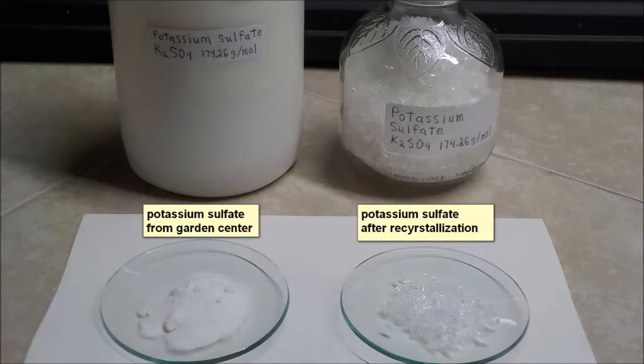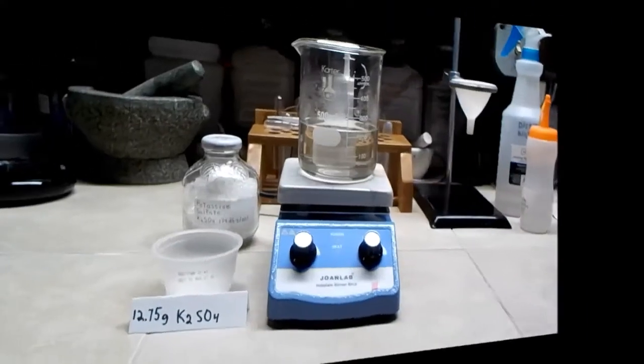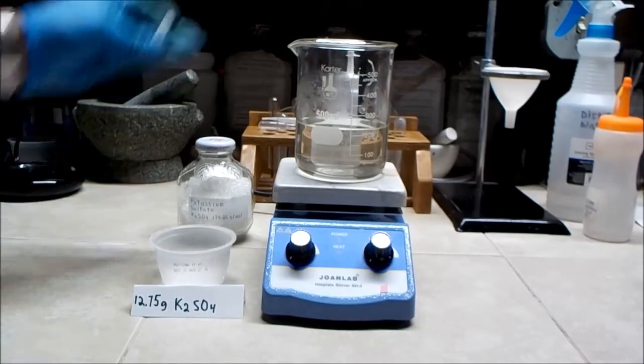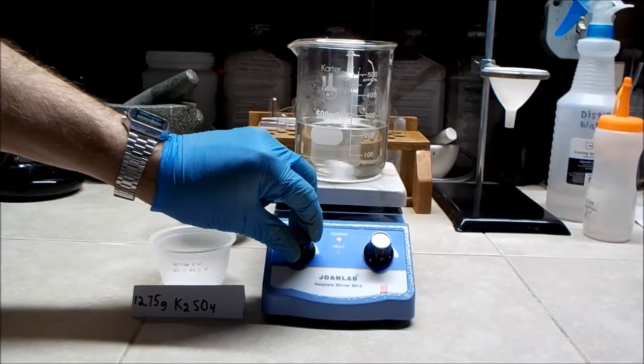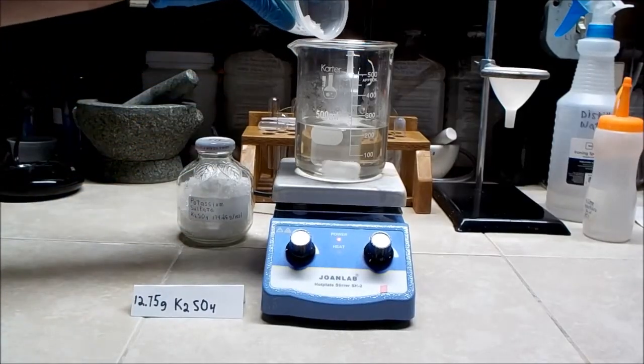Potassium sulfate must be added to the aluminum sulfate to produce potassium aluminum sulfate. Potassium sulfate may be found in most garden centers, but you should clean it up by recrystallization before using it. Using the assumption that I have 25 grams of aluminum sulfate in solution, I have weighed out 12.75 grams of potassium sulfate, which is the 1 to 1 molar ratio between potassium sulfate and aluminum sulfate.